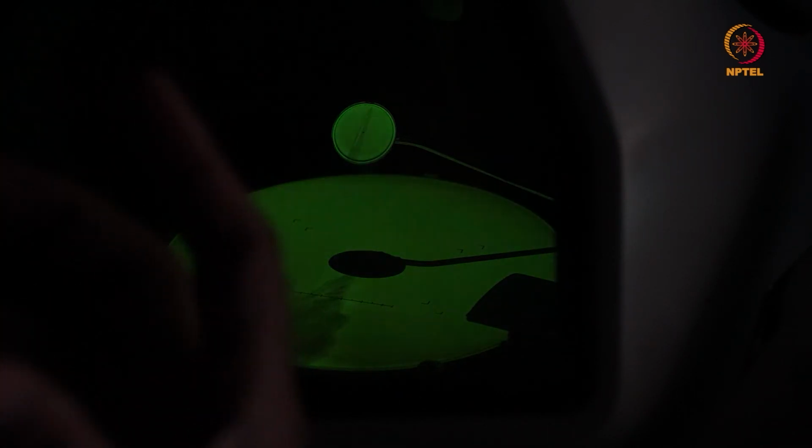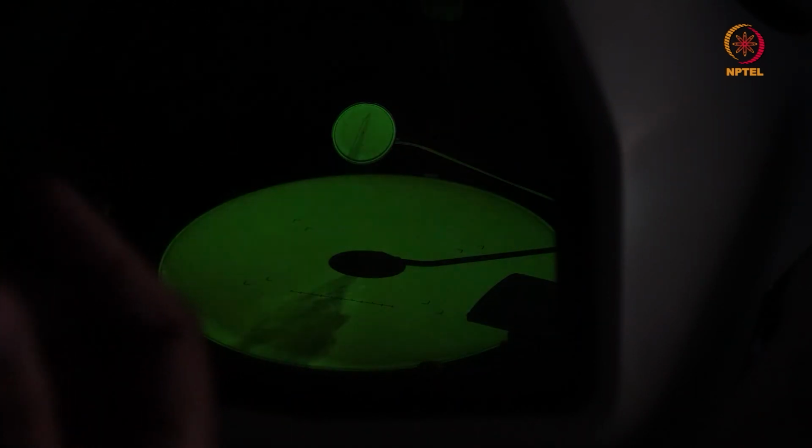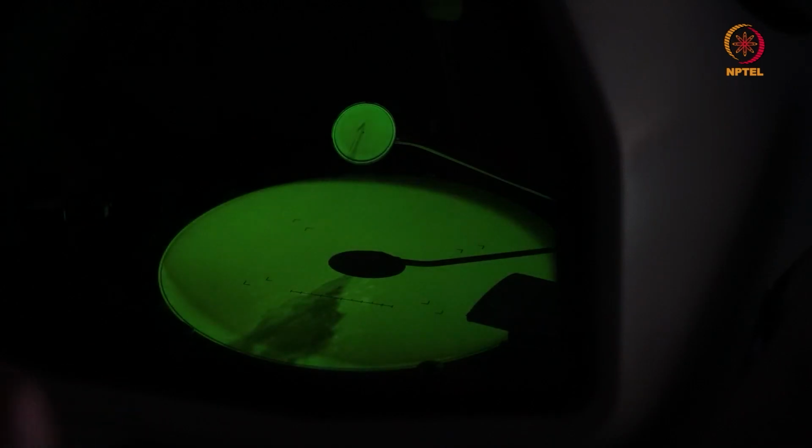From this particular camera angle and the way you see it, it might be a bit difficult to comprehend, but what you should see is the shadows, the bright and the dark shadows you see on the large screen here. They should all coincide at the same point and remain in the same plane. Now, a similar thing is done in rotation center alignment in a Thermo Fisher machine.